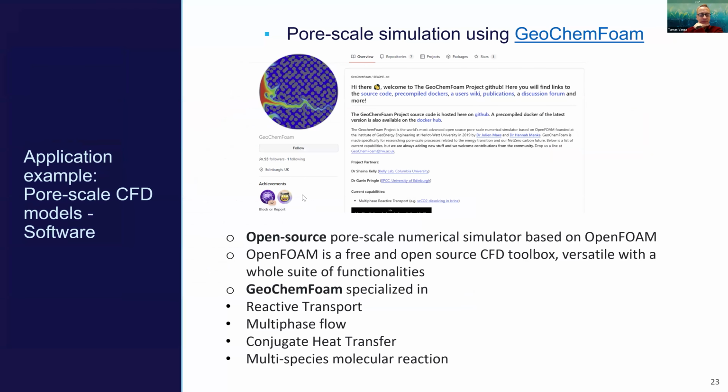Yeah. Okay. Great. So what I'm going to present is some work that I've been doing recently, so it can be seen as the extension of what Arunima and other team members have accomplished. Basically, after we got those 2D representations of the pore structures or pore connectivities, how can we utilize that to do some modeling or simulation? One of the options is to do this pore scale CFD type of modeling.